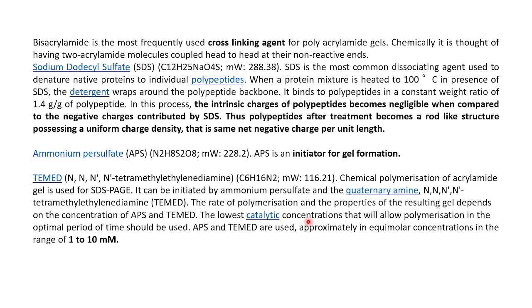So the joining and the breaking of the bonds formed between the free radicals are very spontaneous. Okay, and these bonds are entropically very high. So once a bond is formed, TEMED is involved in stabilizing this bond such that it does not again break up. So that is where the role of TEMED comes. It stabilizes the formation of the bonds, thereby speeding up the polymerization process. Otherwise, it will take a longer time for the gel to ultimately form.